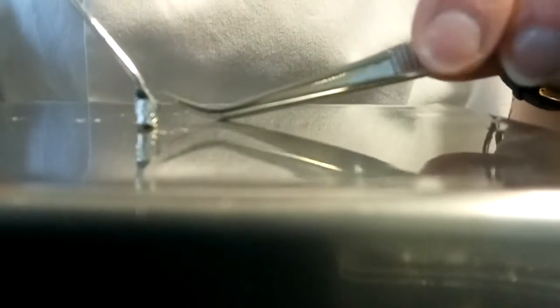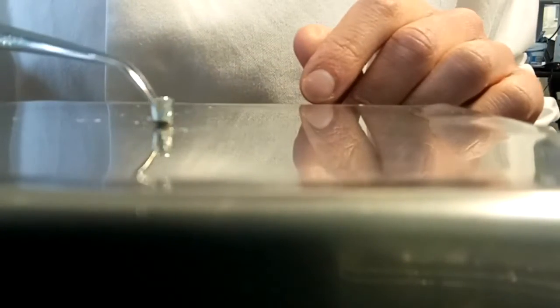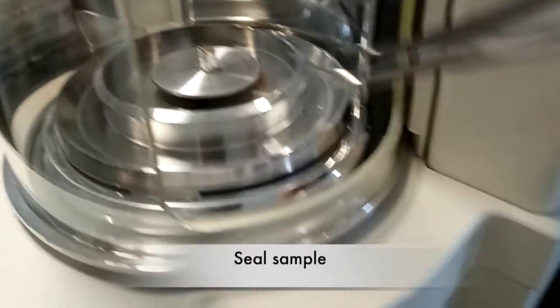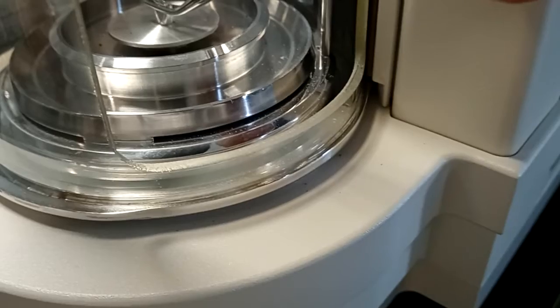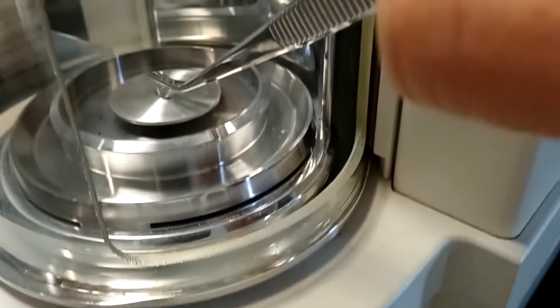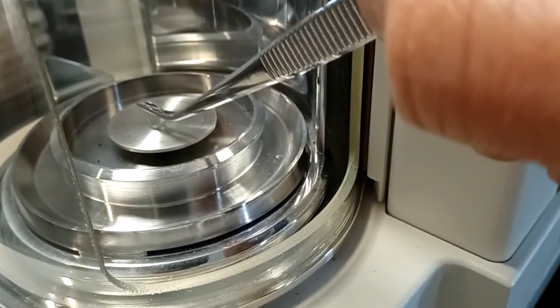Whilst weighing out the sample into the tin cup, it can be really useful to stabilise the cup with a pair of forceps, making sure that you always use smooth areas of the forceps. Once you've weighed out your sample correctly, leave the tin cup in the balance and use the smooth parts of the forceps to gently crimp or seal the top part of the tin cup, then gently remove it from the balance and lay it flat onto your work surface.